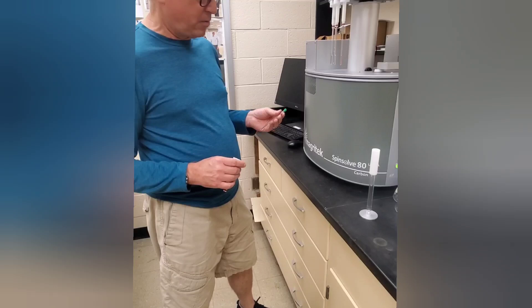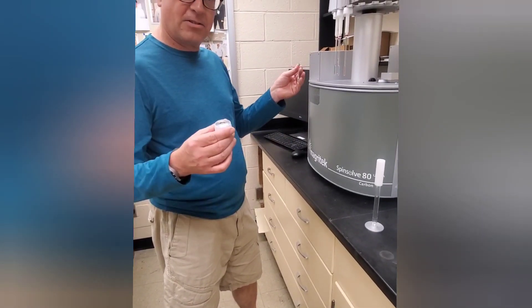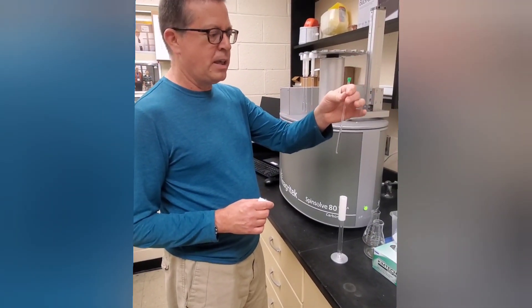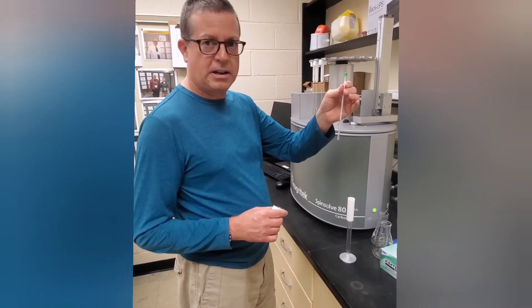The initial part of the demonstration for how to use the Magritek Benchtop NMR is how to load a sample. Most of you probably already know how to do this, but just in case: we have a loaded NMR tube. Make sure that you have at least half a milliliter of liquid in order to hit the fill line.